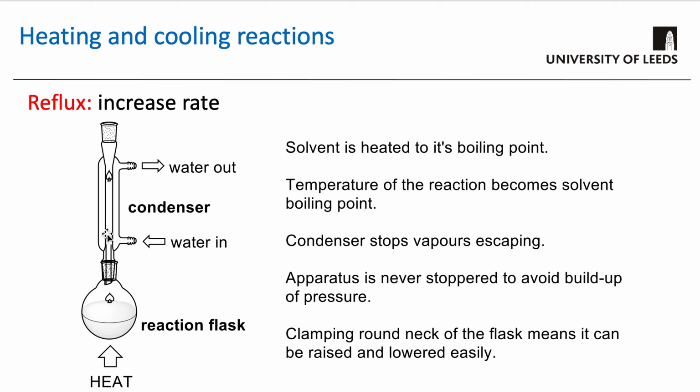So the water vapors come up, they cool down and condense in the condenser, and they drip back down. And so what we know is that when we have a reflux reaction, you start seeing that boiling and condensing. So you see a drip, drip, drip of the solvent going back into the reaction flask. That's when we say a reaction is at reflux. Okay, so the temperature of a reaction at reflux is always whatever the boiling point of the solvent is. In this case, it'll be water, so it's 100 degrees.